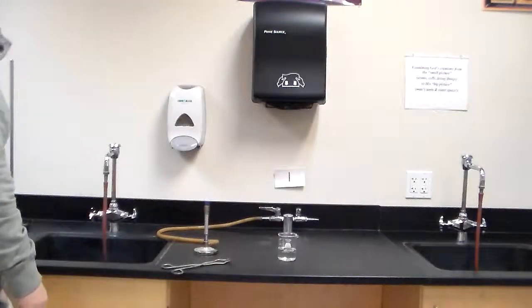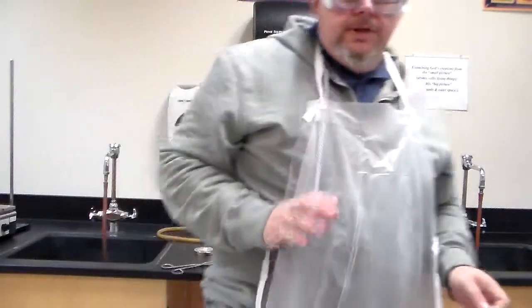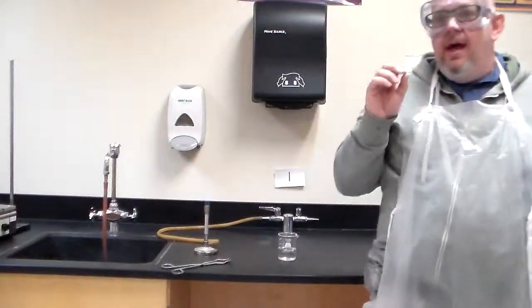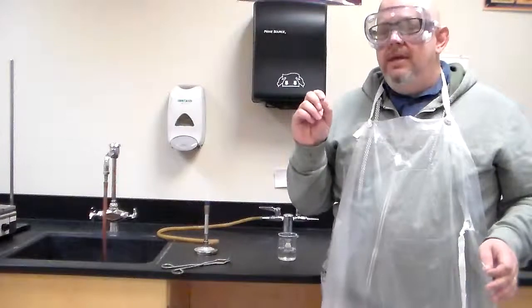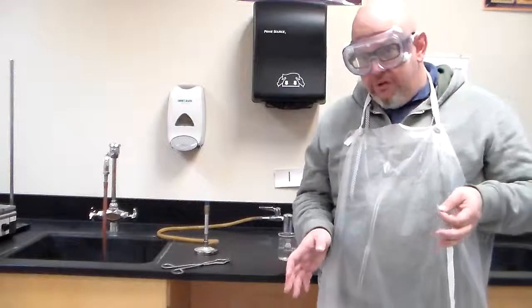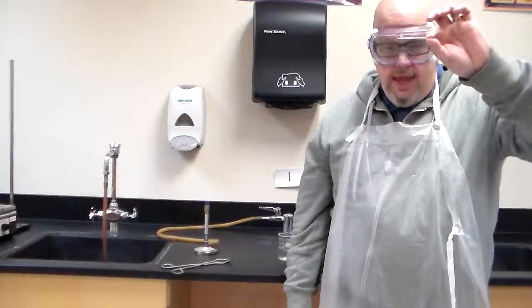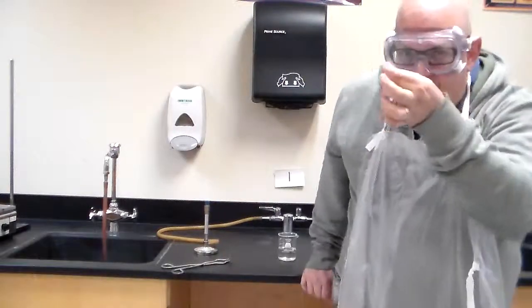Now, what's going to happen? What's the idea behind the Flame Test Lab? What you guys are going to be doing, you're going to be identifying a cation that's being burned off. There are going to be a number of toothpicks that will be soaking in a solution. Now, I don't have the solutions prepared yet, but I did put a toothpick and I soaked it in something. Right now it's a white powdery thing.